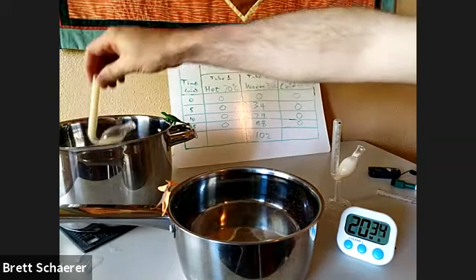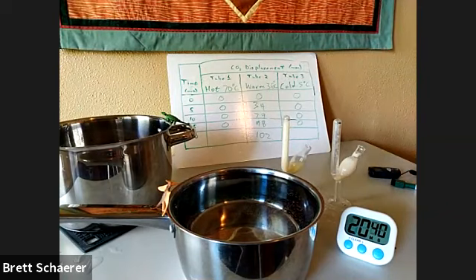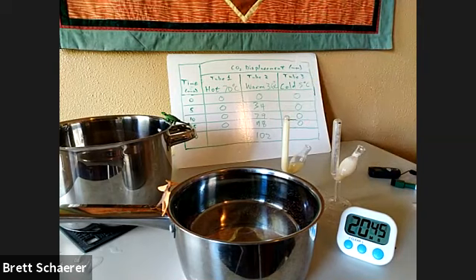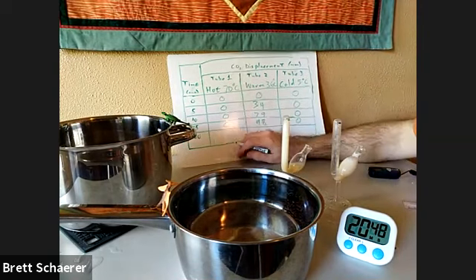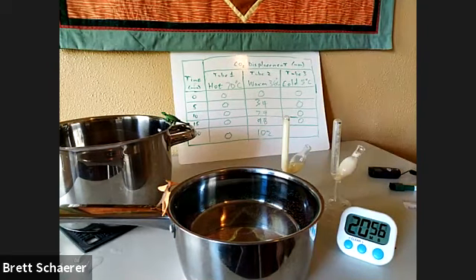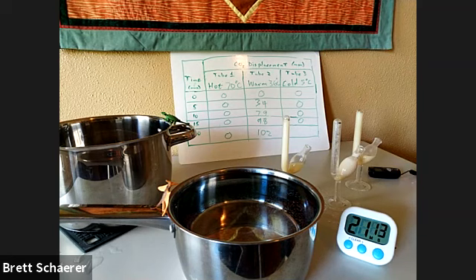And we'll check the hot tube, tube 1. And that is still at 0. And lastly, the cold tube, tube 3, is still at 0.